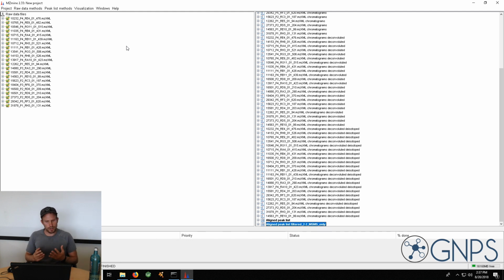How stringent you want your filters to be really depends on your needs, and you have to figure this out on your own. This is an overall very stringent cutoff of features, especially as we do not consider stuff which did not trigger an MS2. So if you want to look in detail into your samples, you may want to enable this function in order to get more information out of your data. However, from here, I think for the tutorial, it's good to continue.